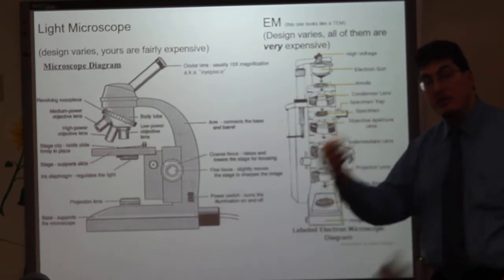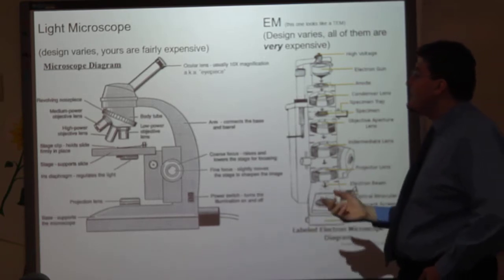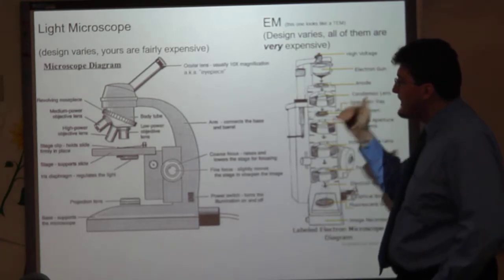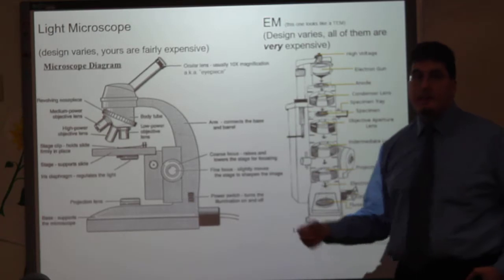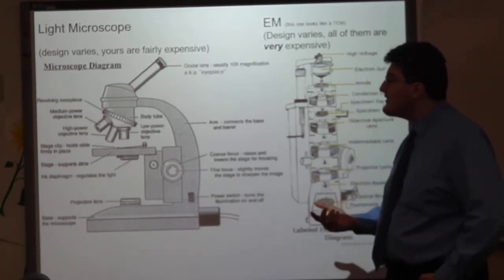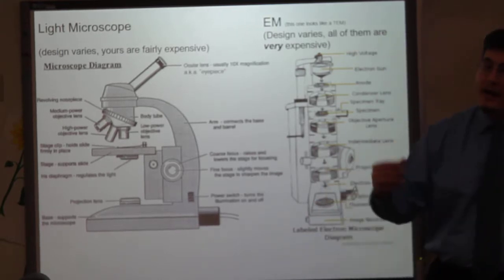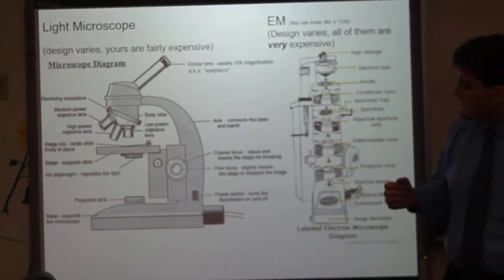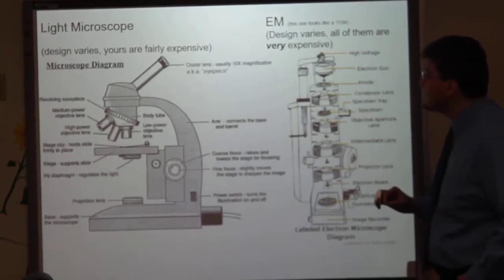In the microscopes that we use, we have a revolving nose piece. You don't always have to have this. The microscopes that we use have 3 different objectives, a low, medium, and high power that I've already discussed. We have stage clips which hold the microscope slide in place. We also have mechanical stages on our microscope which allow you to move the stage in an X and Y axis plane without having to touch the microscope slide with your bare hands.